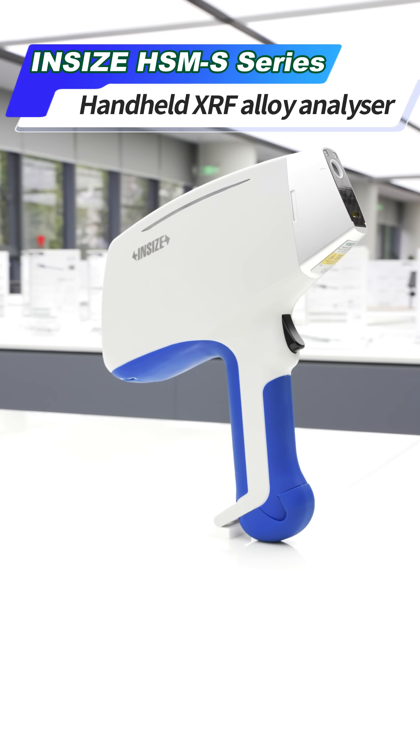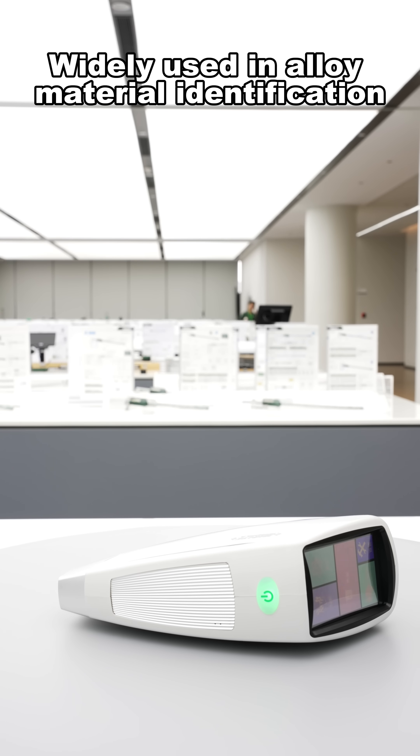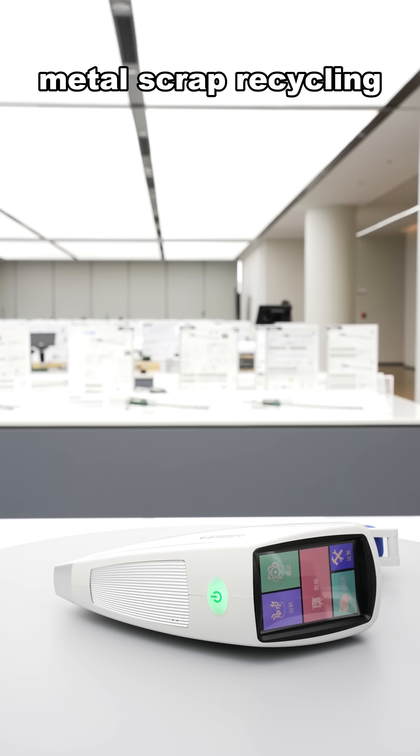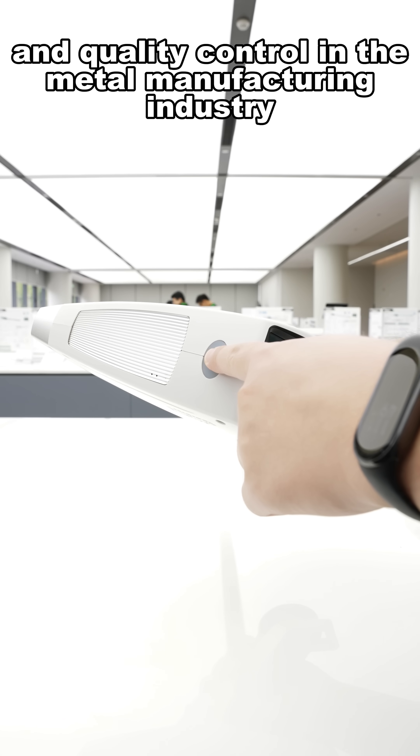Insize Handheld XRF Alloy Analyzer — widely used in alloy material identification, metal scrap recycling, and quality assurance and quality control in the metal manufacturing industry.